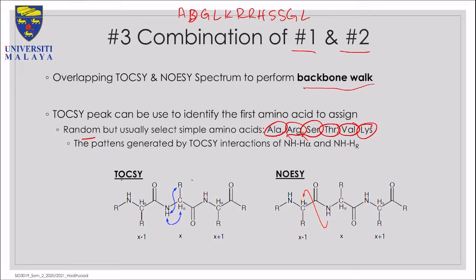So what I'm doing now is just to look at NMR and how NMR helps you to identify the sequence of the protein and peptides. But what you can actually use it for is to predict how the structure will look, whether the sequence forms an alpha helix or a beta sheet, or it's just a random coil. So those are the things that you can do, and based on this information, instead of doing a crystal structure and solving a crystal to get the crystal structure of a molecule, you can also use NMR and observe the structure of the proteins.